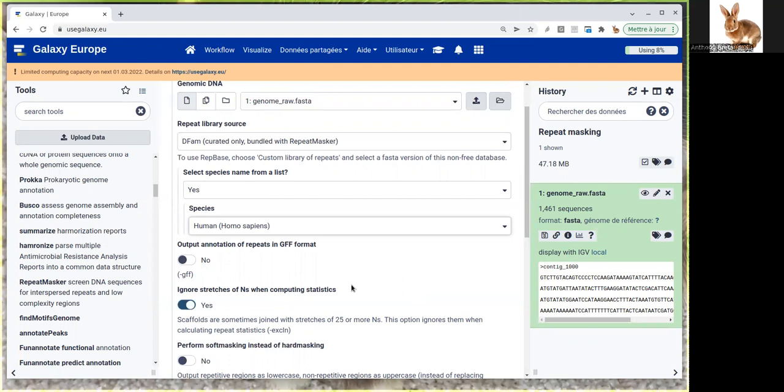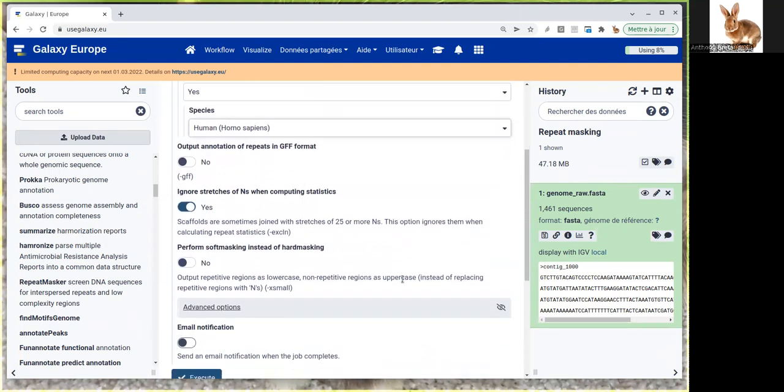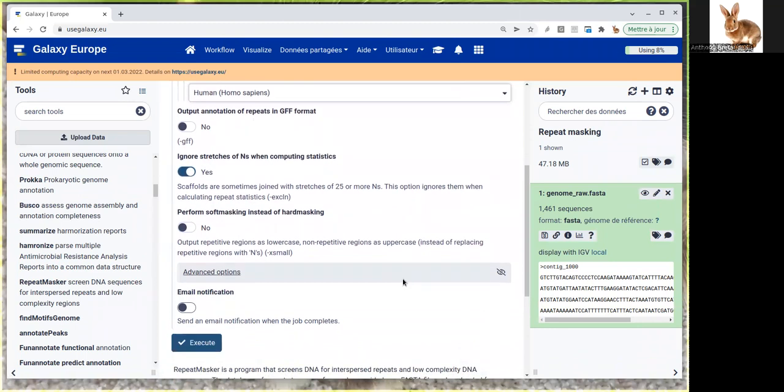There's an important option we need to specify: do we want to perform soft masking or hard masking? Here we want to perform soft masking. I'll execute.